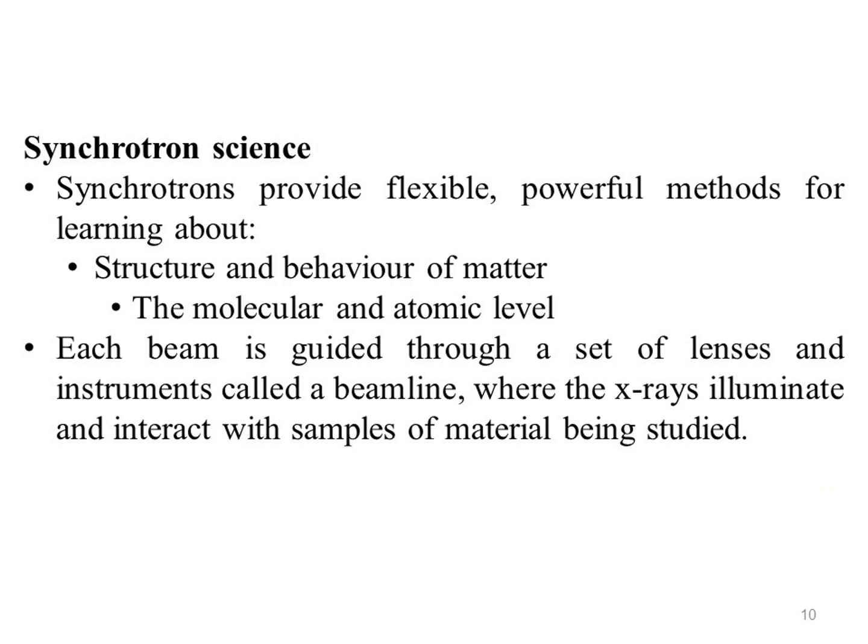Synchrotron science. Synchrotrons provide a flexible, powerful method for learning about the structure and behavior of matter at the molecular and atomic level. A synchrotron is a stadium-sized machine that produces many beams of bright X-ray light.